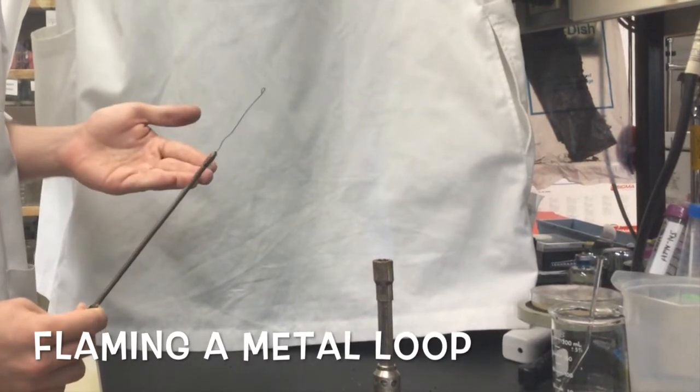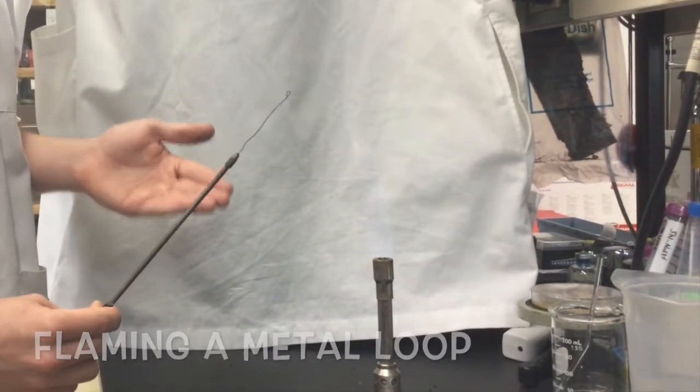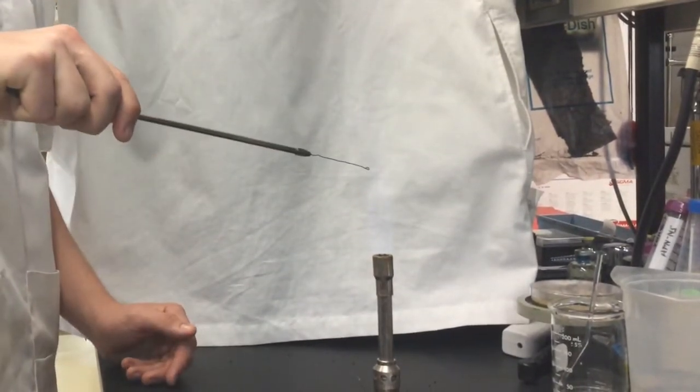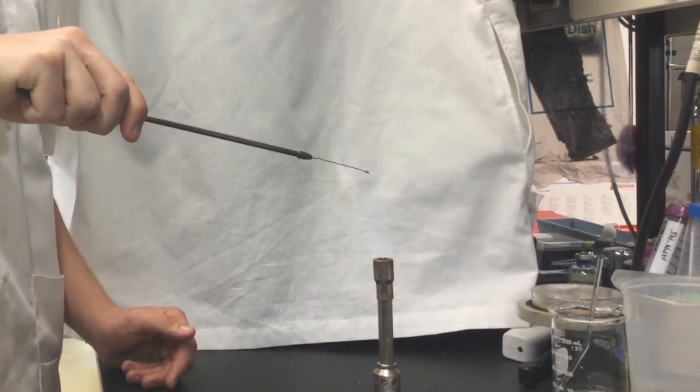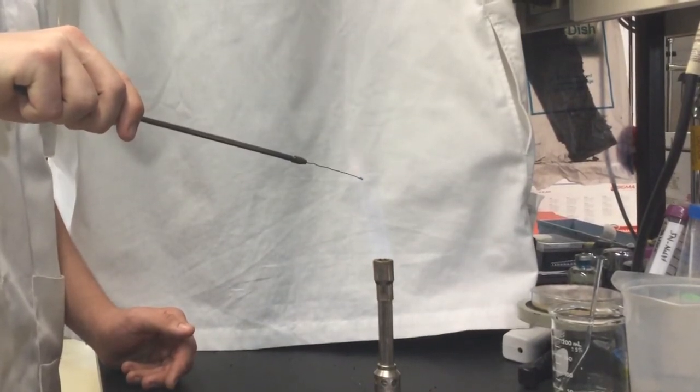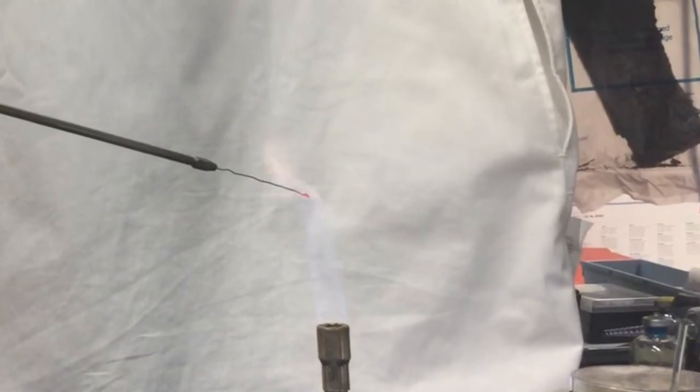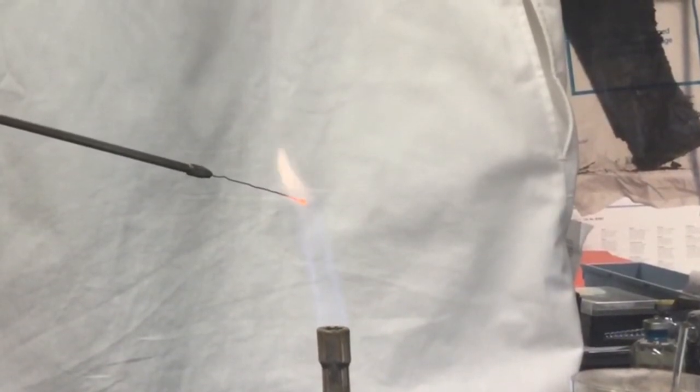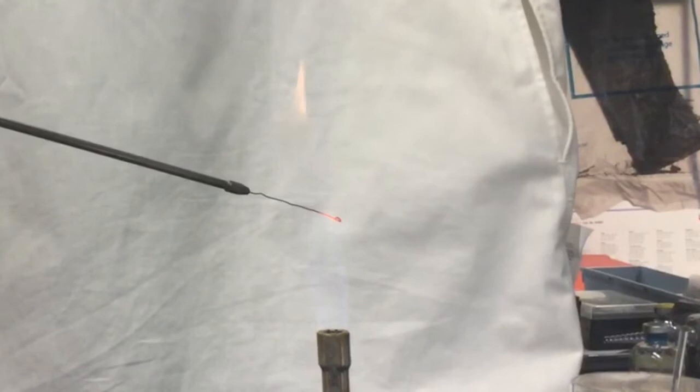Let's start with the metal inoculating loop first. Hold the tool facing downward. Place the end nearest the handle into the Bunsen flame and hold it there until red hot. Then draw the tool through the flame slowly until each part glows red.